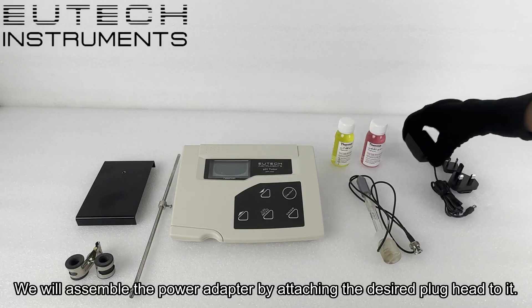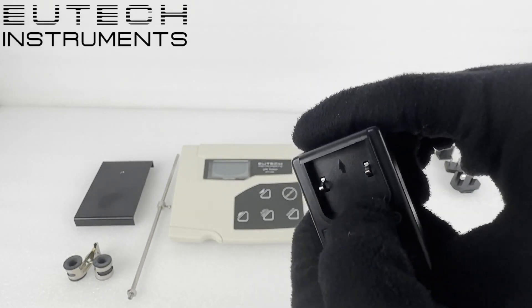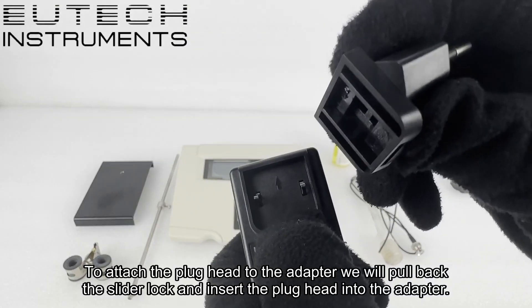We will assemble the power adapter by attaching the desired plug head to it. To attach the plug head to the adapter, we will pull back the slider lock and insert the plug head into the adapter.